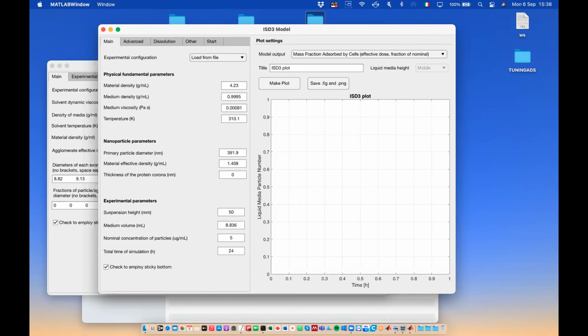So regarding this one, we used some data that were already available within the project regarding this kind of situations. So we use JRC benchmark nanoparticles to check and validate the model. We use titanium, cerium oxide, and barium sulfate.